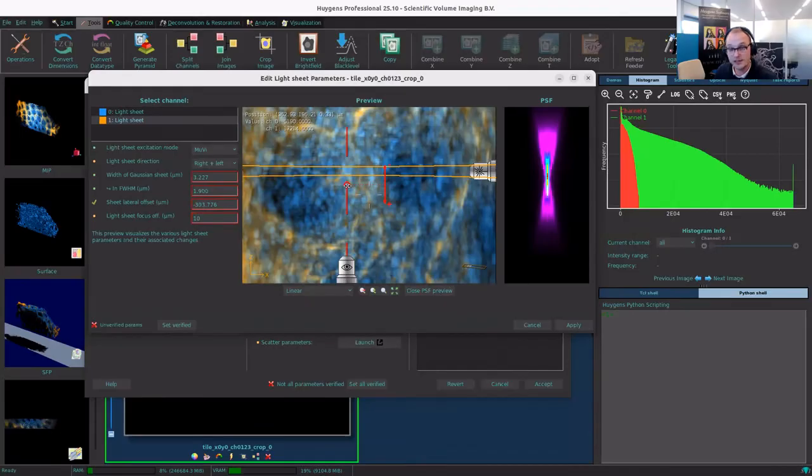If I didn't completely understand your question, maybe you can reformulate it or let me know if that's it. In the XY, I see. So your question is if you notice that, so this is a little bit of a technical answer. If you have a scanning system like a confocal system, then your detection and illumination PSF can be misaligned, and then you will have the effect that you're discussing about.